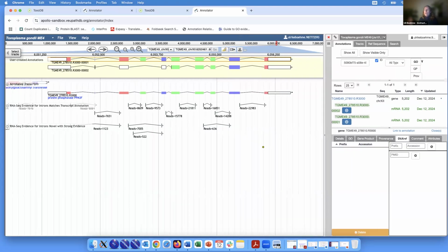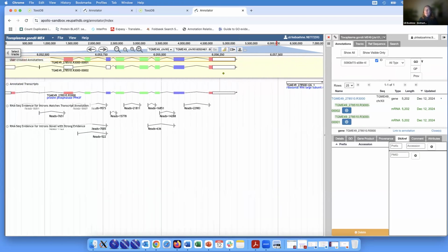And that's all. And maybe just one more thing, just to show you, it's not only easy to delete exons. It's also very, very easy to modify exons or modify UTRs. You just need to click on the exon or the UTR. You can see there is now a border, and then hover at the edge until you can see this little arrow, and then you can modify it. Make it longer or shorter.